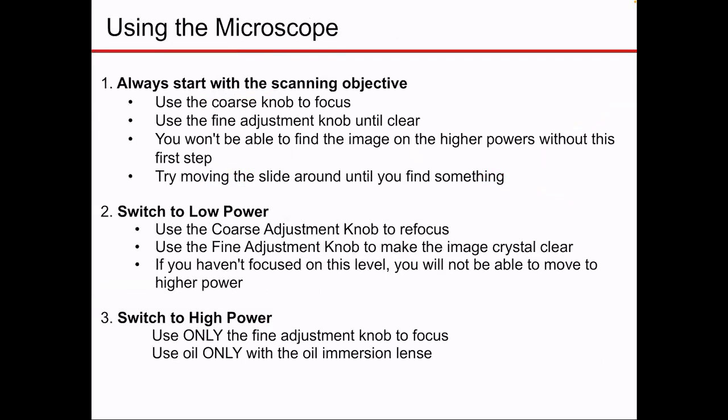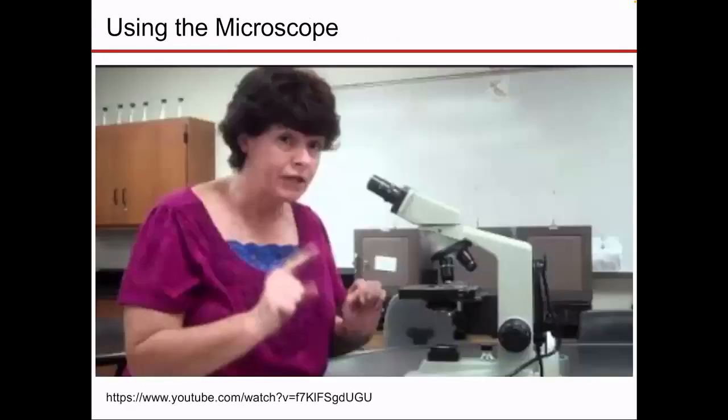So this final slide summarizes some rules that you should always keep in mind when you are using the compound microscope. You can revise them on your own. What I want to show you now is a video that gives you some good advice on how to use the compound light microscope correctly. Let's take a look at this video.